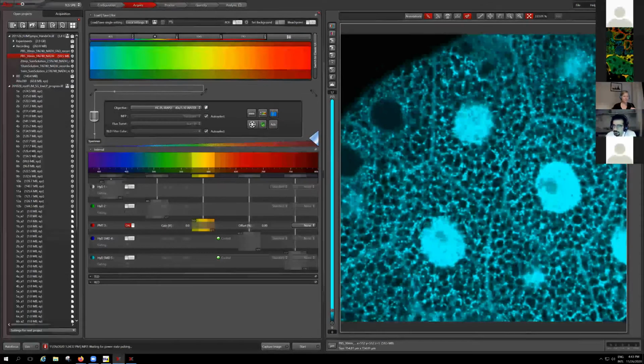And there's a comment from Amazi, which I think is exactly the point. For metabolic FLIM, you're measuring live specimens, so you want your sample to be as lively and happy and natural as possible. This contradicts a bit the idea of fixing the sample. But there is data also from the Amazi Periasami lab, from Horst Wallrabe, for example, testing certain fixation times and how that affects lifetimes. Yes, it affects, but maybe it's not the best thing if you want to study a happy living sample.